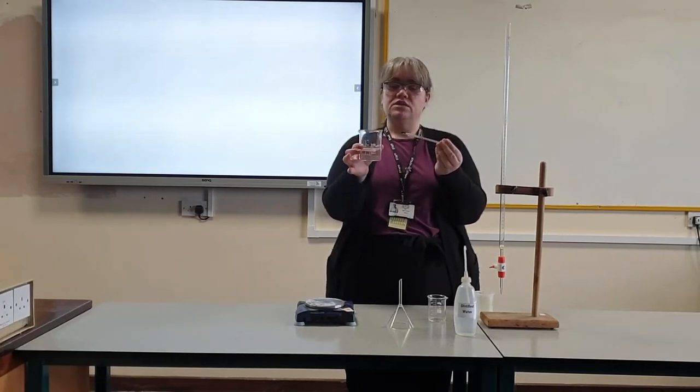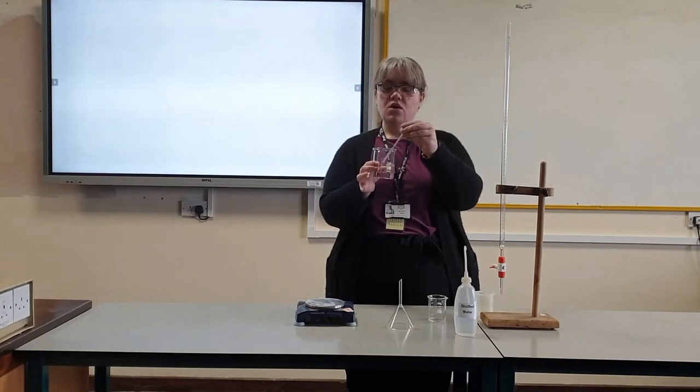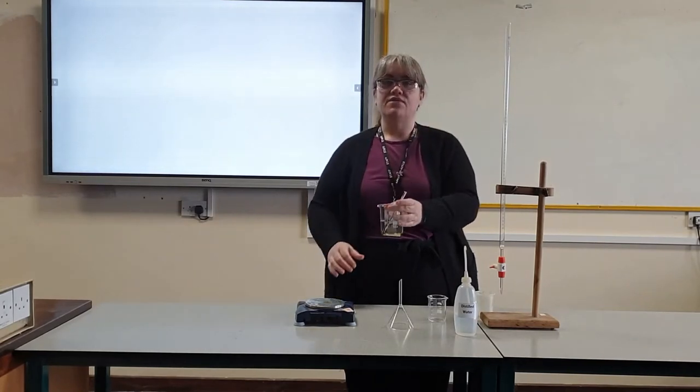To start with, put some distilled water into the larger beaker with the thermometer and leave it for at least 10 minutes to reach room temperature. Record the temperature from the thermometer.